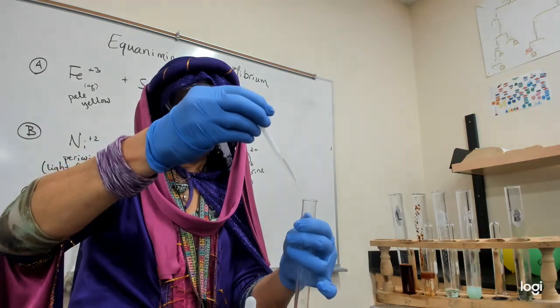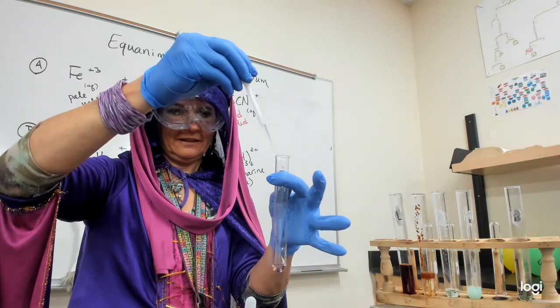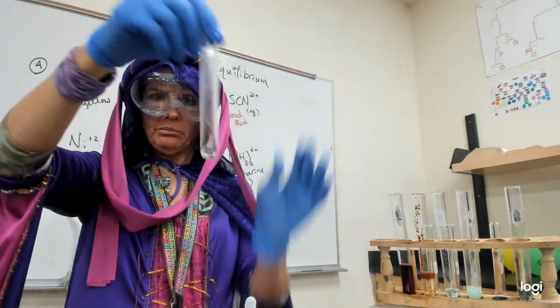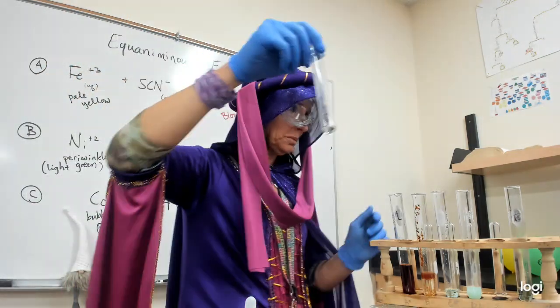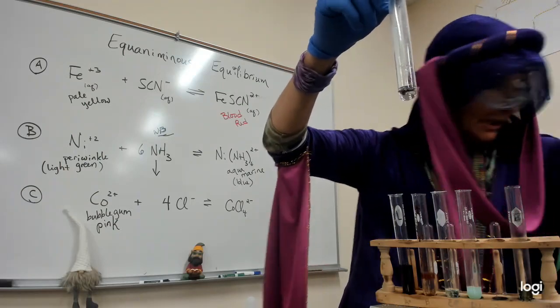You can talk to me while I'm doing it. Is that 12? I kind of lost track. But it didn't look like much happened. It still must have been kind of rejected, but this is the cool part. All right, because I figured out how to make it work.